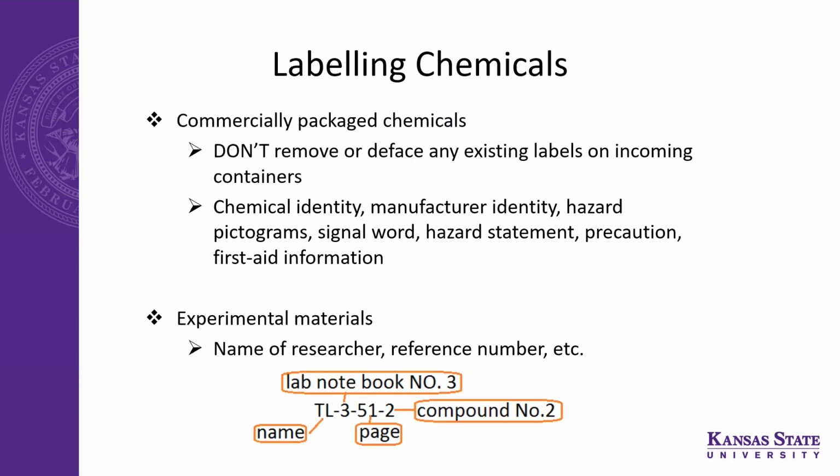Are you labeling your chemicals as to when they come in? Do you actually do that on the bottle, or do you just do it in the inventory? Do you put the date that you bought it? In the inventory, do you put anything on the container? No, okay. Only in the inventory, because the inventory has the location and all the details.